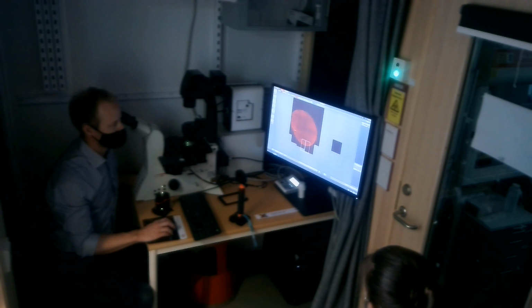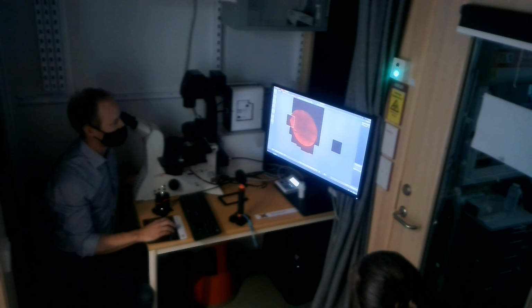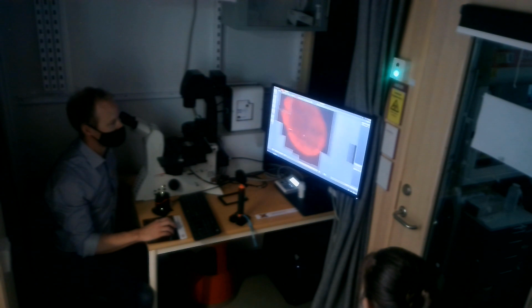Maybe that one also will want. And there's a little bit to see there. So now I think we have the whole tissue, so that we can see, we can move around and so on. Okay?